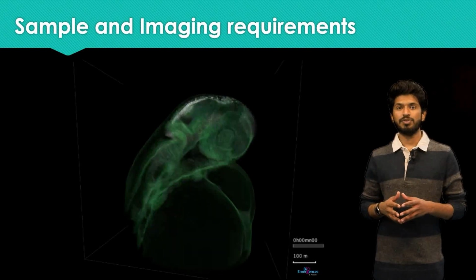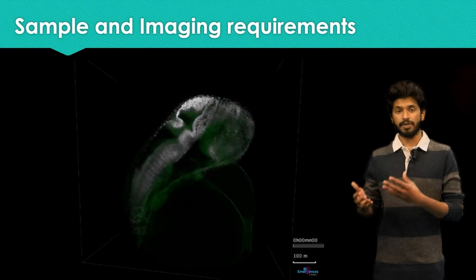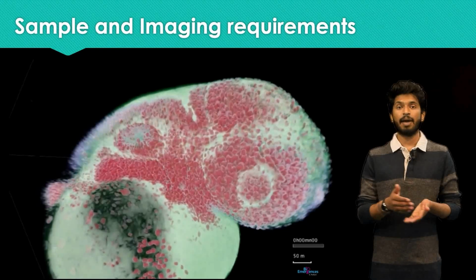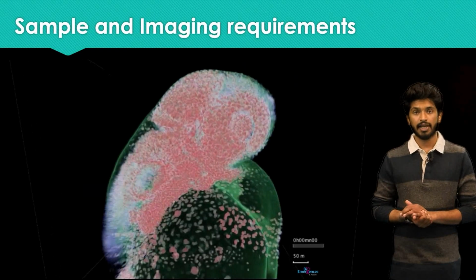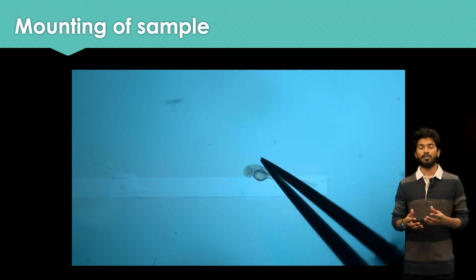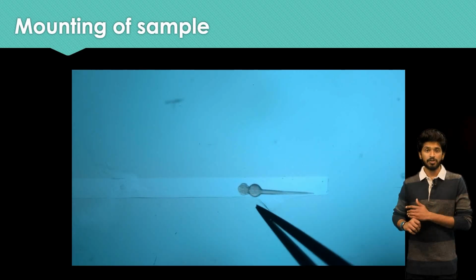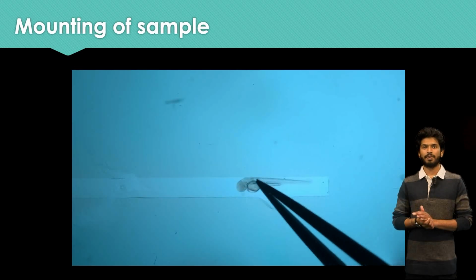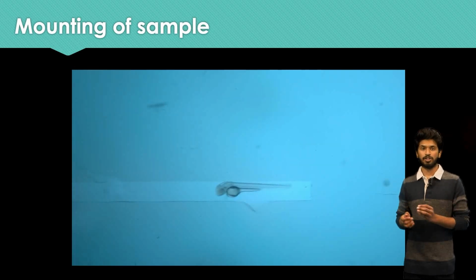If multiple samples need to be imaged simultaneously, a high-throughput imaging setup should be chosen in which samples are mounted similarly and separate samples are imaged at the same time to lower the variability in the results and get a better data set. The mounting of the sample is crucial to prevent artifacts, reduce variability, and take an image with high resolution. Once the microscope is chosen based on the previous characteristics, the mounting needs to be thought of.